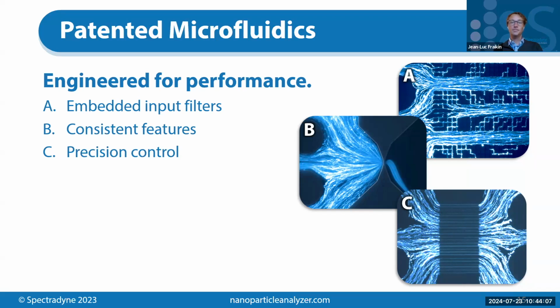Okay. There's another question. I just received one batch of new cartridges recently. Do I need to calibrate them? No, the cartridges are pre-calibrated, so you don't have to do any calibration on site. Okay.